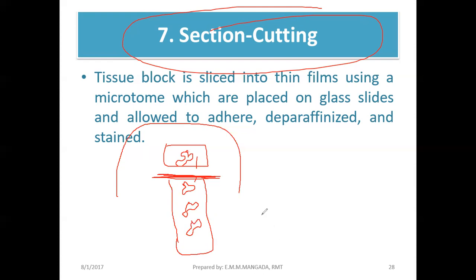Kasi masyadong maliit ha yung cut natin. Yung cut kasi natin guys usually in micrometer, 10 micrometers. So manipis na manipis yan. Okay? So imaginein nyo to. Okay? So we have these pare-pareho kasi nga maninipis na impression nung inyong tissue. Okay, so this is your tissue ribbon.